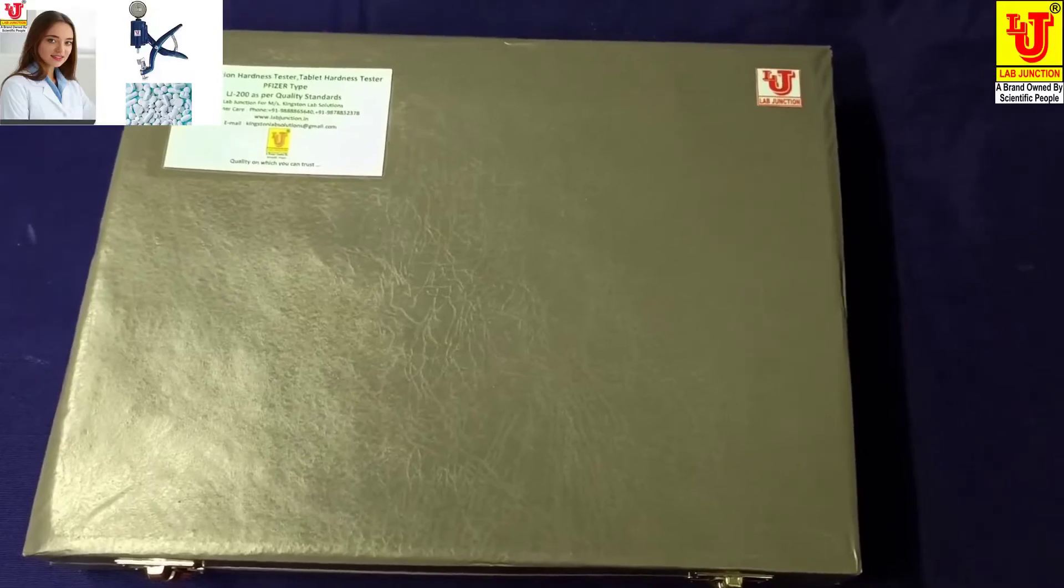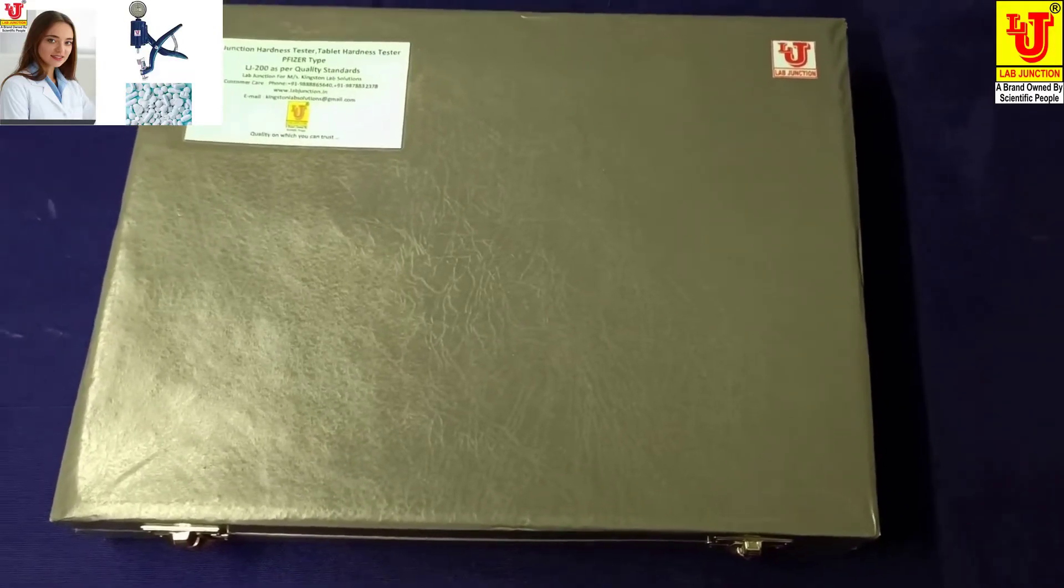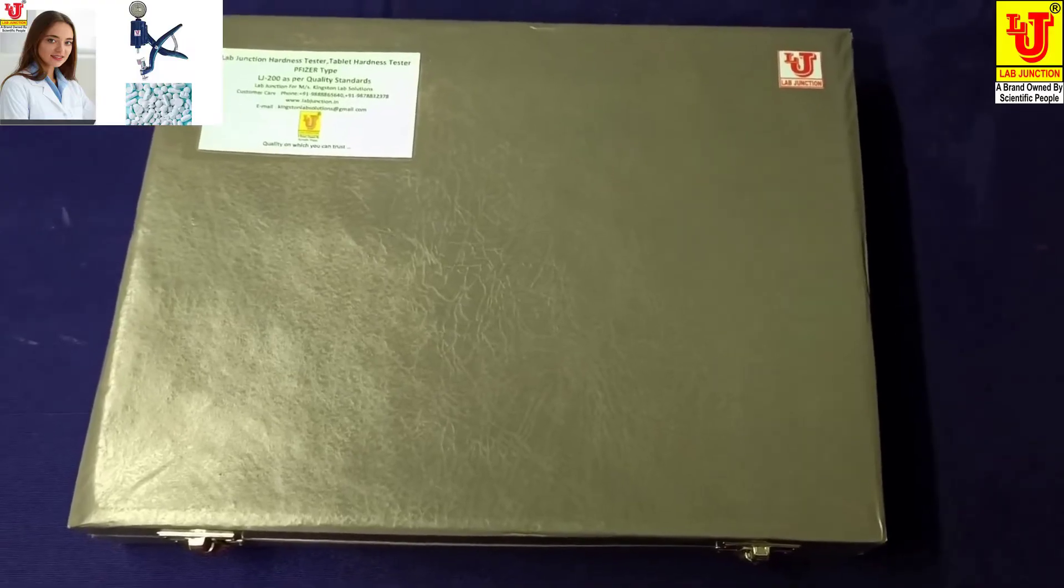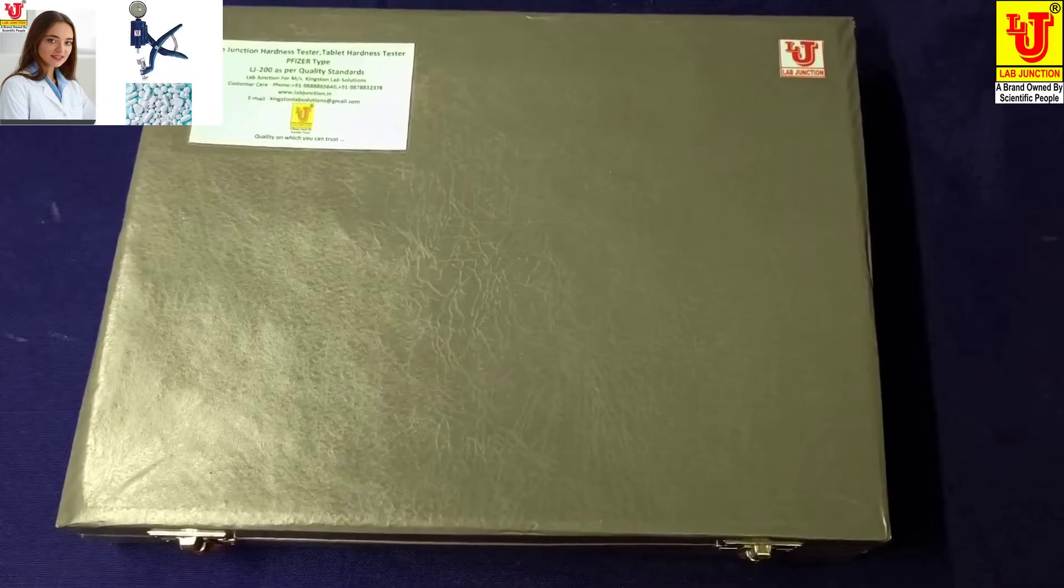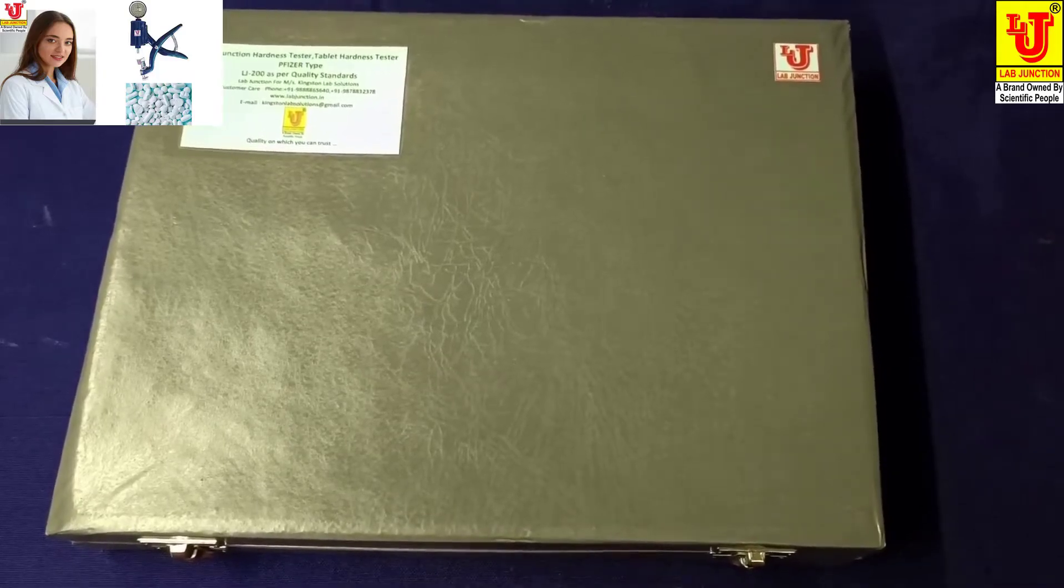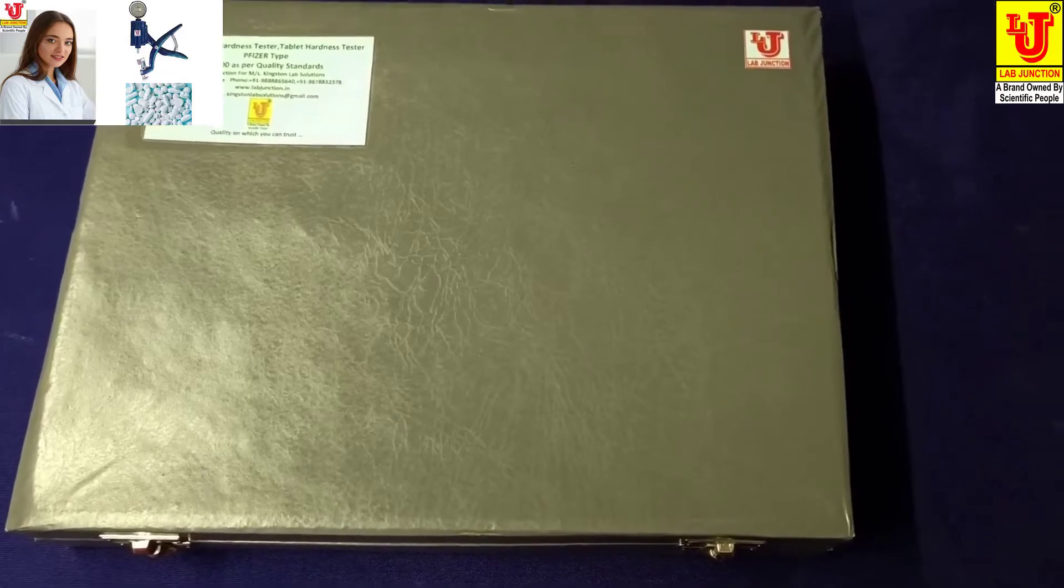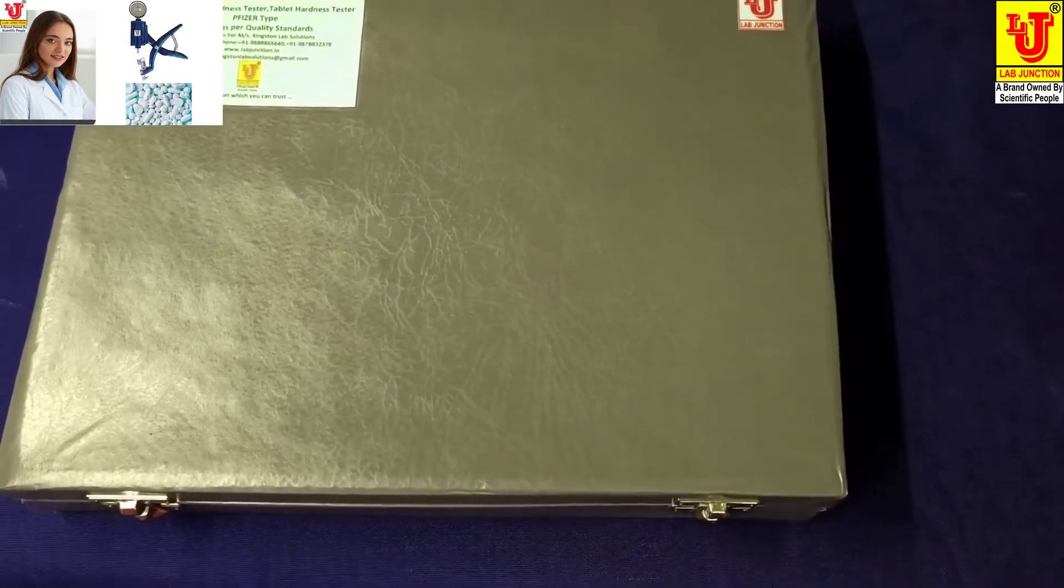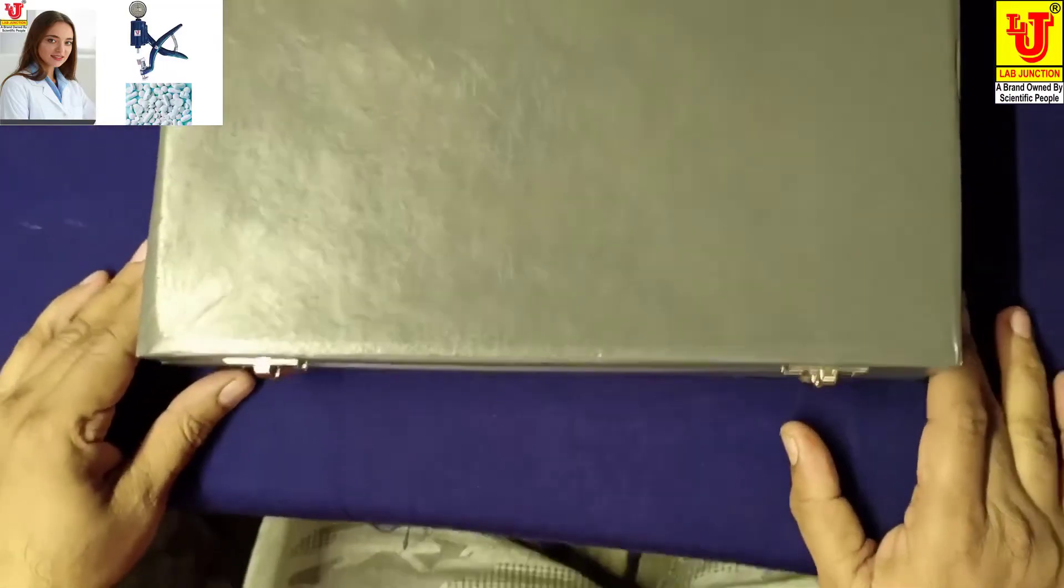Lab Junction Hardness Tester - Tablet Hardness Tester, P Pfizer type, Model LJ 200. As per quality standards, this is our main instrument box.